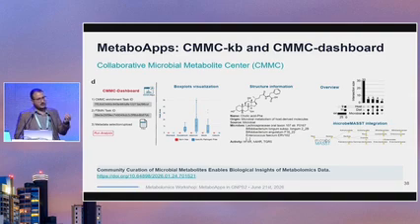And then you're going to have a second ID, which is the enrichment ID. So basically, it's the new version of your job with that information added. So that's the ID you're going to have on the first page here. And then the second one is the original one for the job you have. So it's the FBMN task ID. And then you can select other metadata that you have, just combine all of these together.